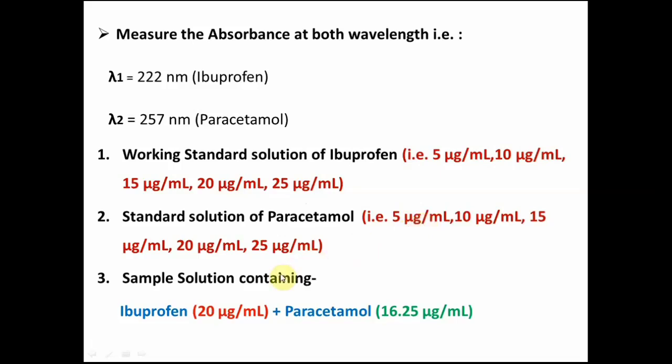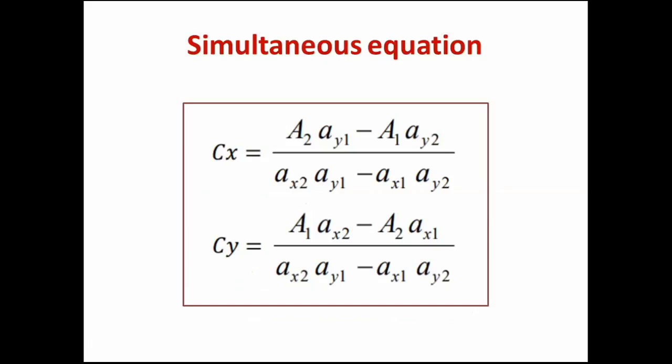After that, we will measure the absorbance of the sample solution, that is the mixture of ibuprofen and paracetamol. Next, this is the simultaneous equation.